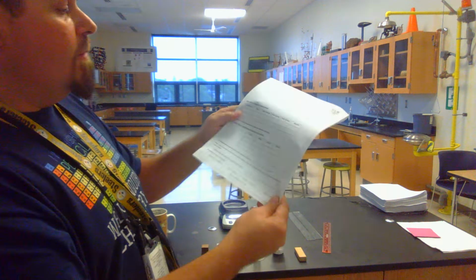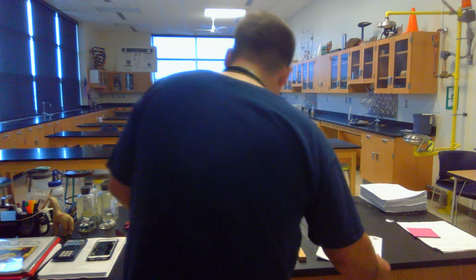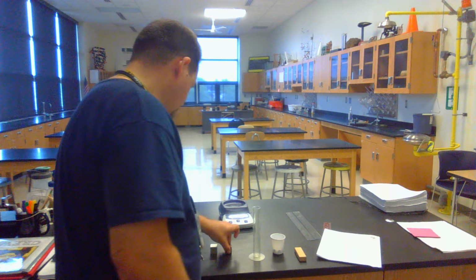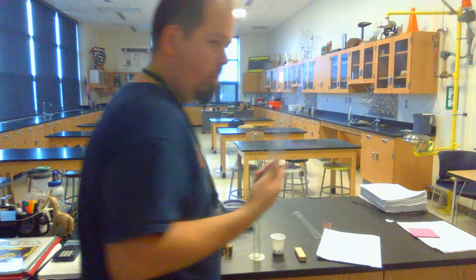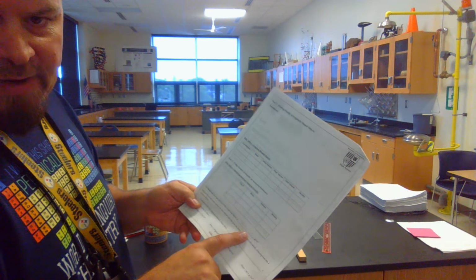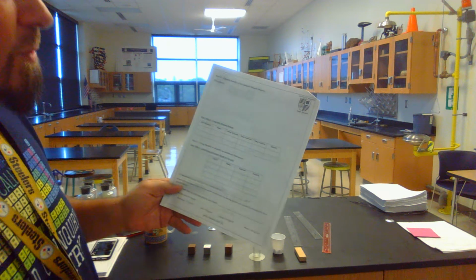Okay. Then we're going to get on to the unknown. So, we're going to do multiple trials. And what I basically want you to do there is each person in your group to do a separate trial. Okay? So, you're going to pick one of the 3 blocks. Okay? And they are numbered, or they will be numbered. You're going to have to mass it. You're going to have to do the volume with a ruler and calculate its density. Then average up your density, get the average of everybody in your group's density so we have a more accurate measurement, and then compare it to these known densities here of 4 potential metals. Then you can pick which metal it is.